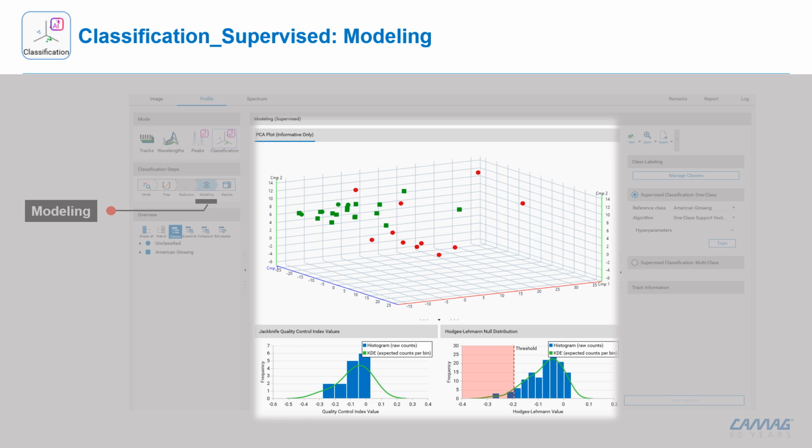The plot section will start to display the classification output, giving each class different colors and shapes. Here we can see that the authentic samples are assigned a green color, while the outliers are given a red color. We can notice that some of the unknowns or test samples are given a green color, which means these samples can be considered accepted.